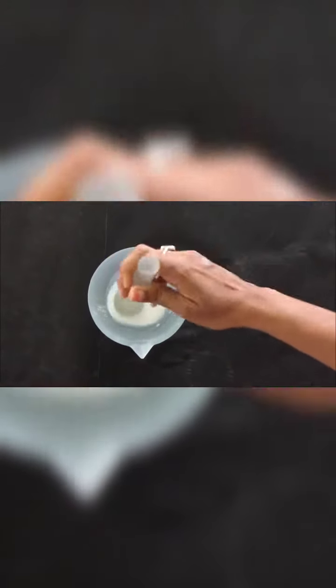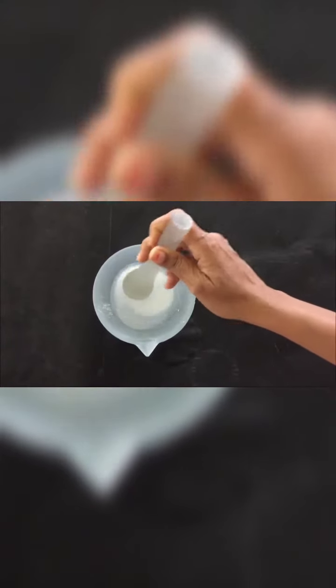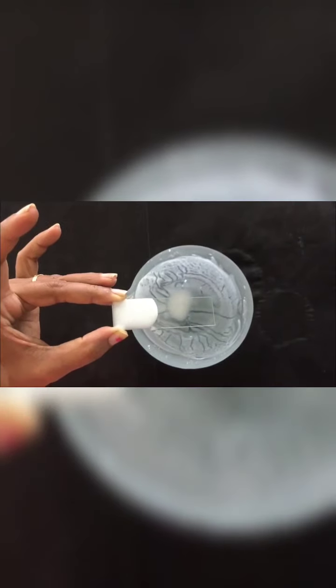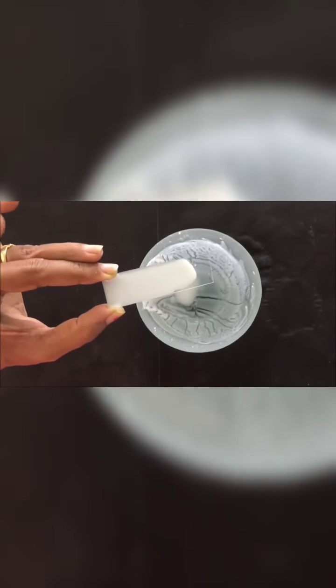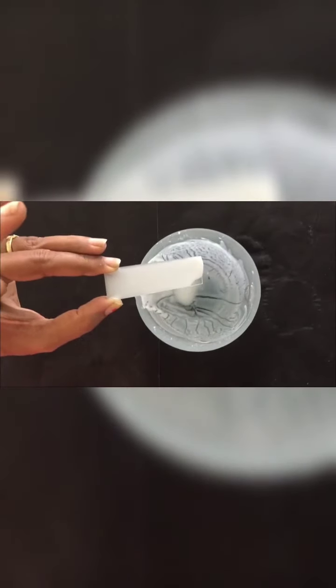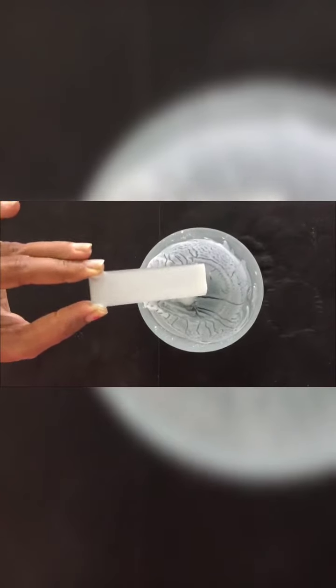Mix it properly to make sure that there are no lumps. Then after mixing, transfer the slurry into the clean dry beaker and by using glass rod make the slurry homogeneous. With the help of pipette, pour small amount of the slurry on the clean dry glass plate and then move the plate around to spread the slurry uniformly over the glass plate and to form thin uniform layer of adsorbent of about 0.2 to 0.3 mm thick.